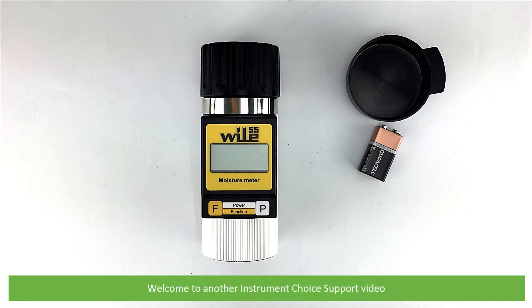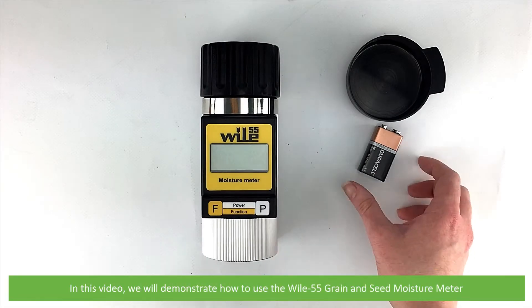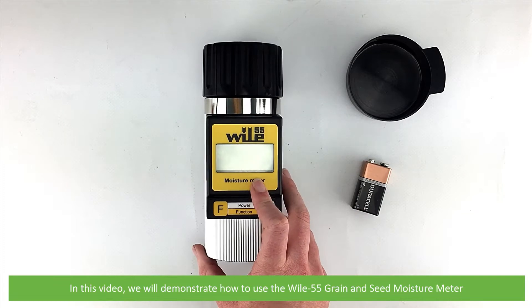Hi and welcome to another Instrument Choice support video. In this video we'll demonstrate how to use the Wiley 55 grain and seed moisture meter.